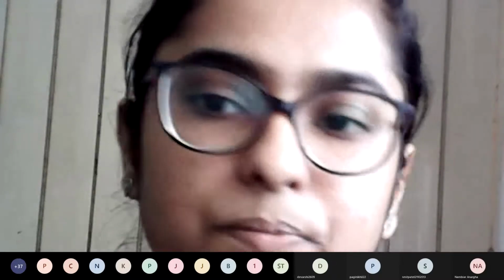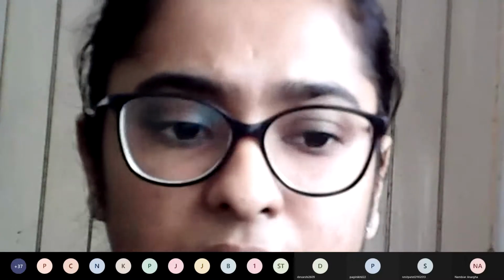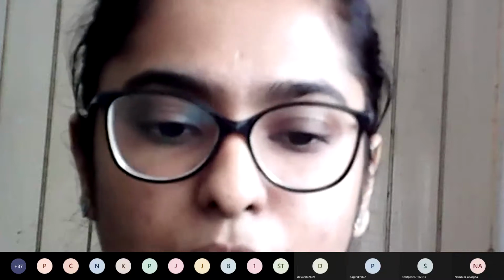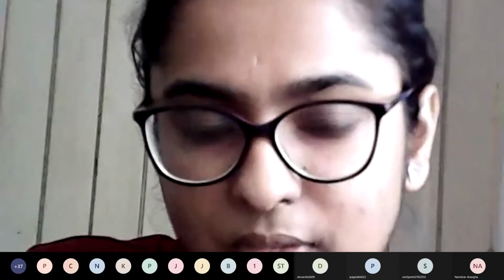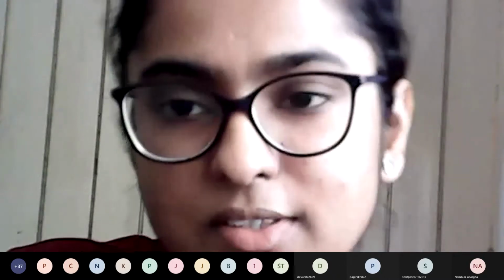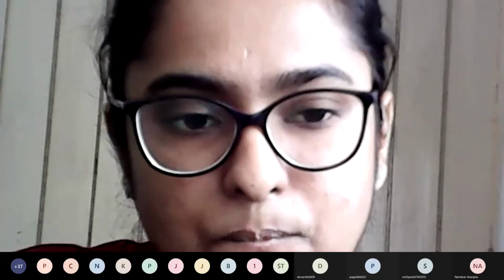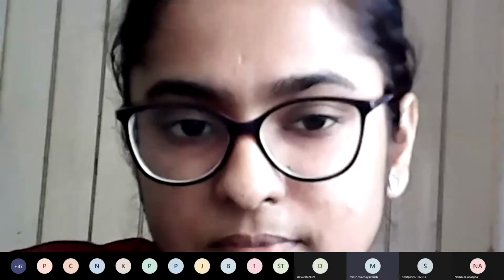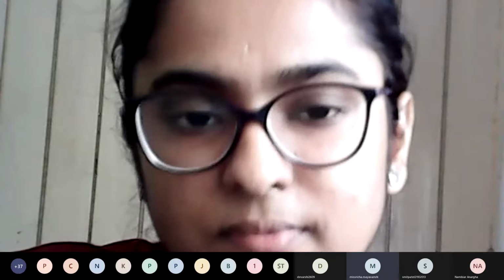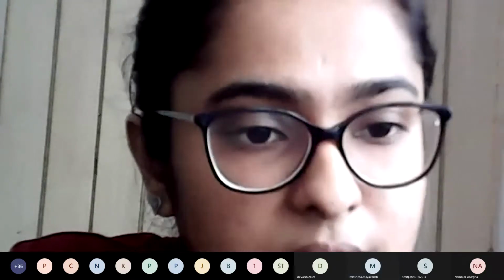Before I continue, complexometric is one type of titration. So can anyone tell me which are the basic 4 types of titration? At this stage, you must be able to say. 4 basic types of titrations are there. Which are they? Yes, Richa? Ma'am, acid-base titration, redox, precipitation, and complexometric. Fine. Good. So these are the 4 basic ones.